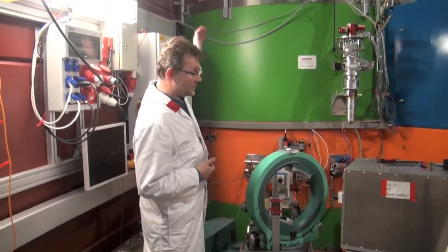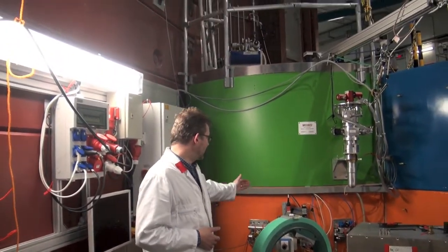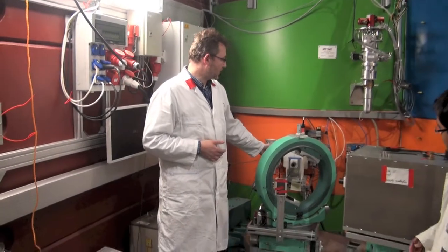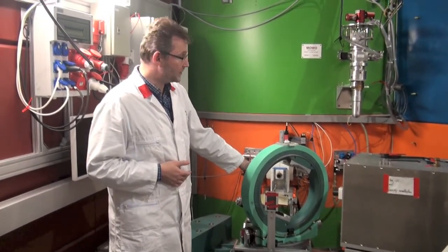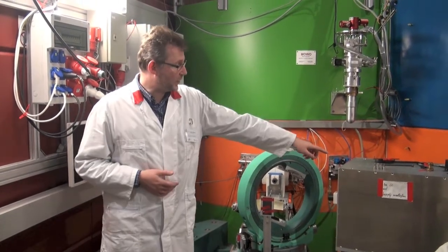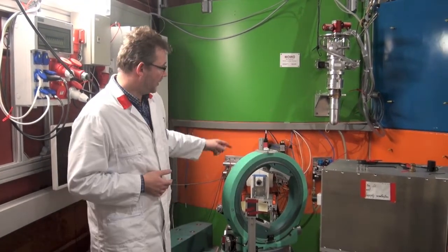It gets the neutrons from the reactor source. The beam is then guided monochromatically through this tube. It enters the sample over here and scatters the neutrons in a way that we catch the fingerprint of the sample in this detector here.